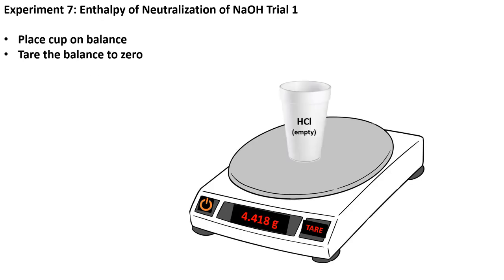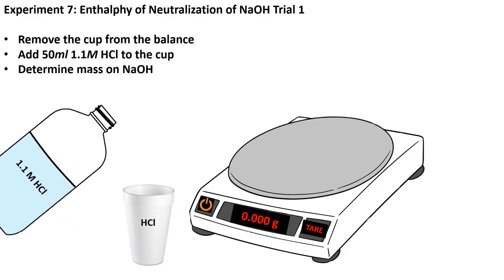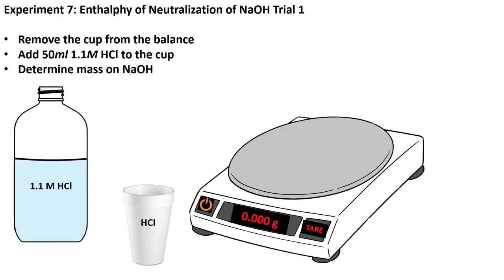on the balance. We tare the balance back to 0 and then remove the cup. Add the hydrochloric acid, and then place the hydrochloric acid on the balance. 51.014 grams is the mass of hydrochloric acid in our cup.